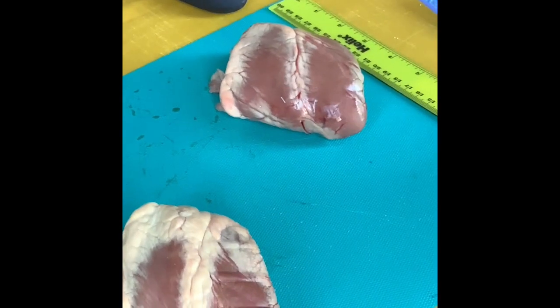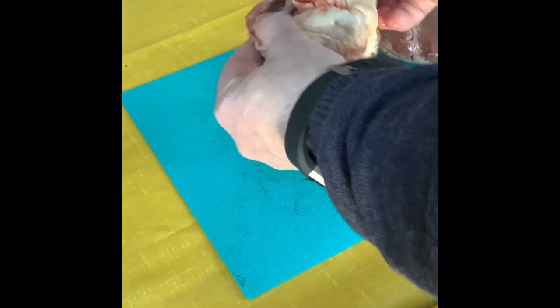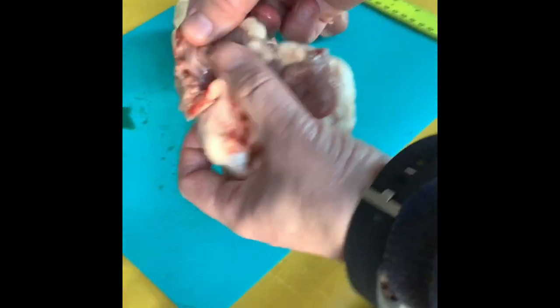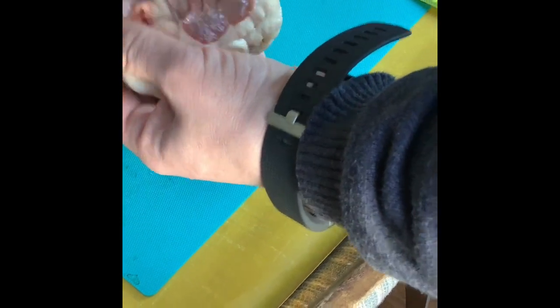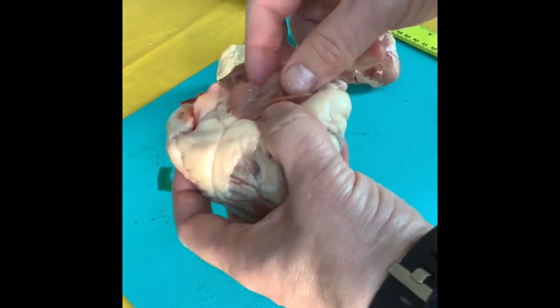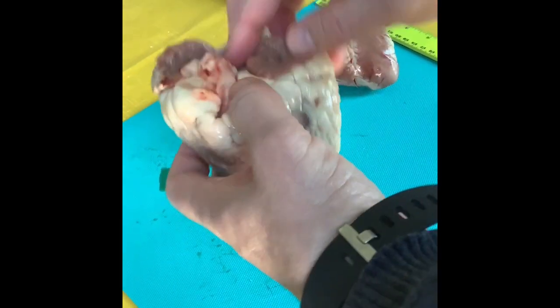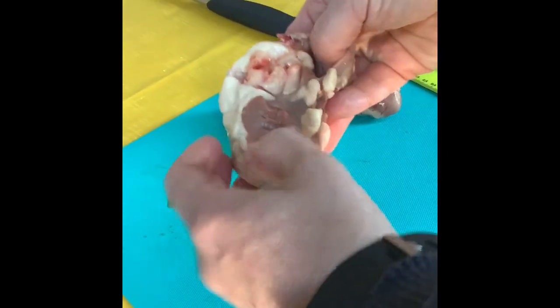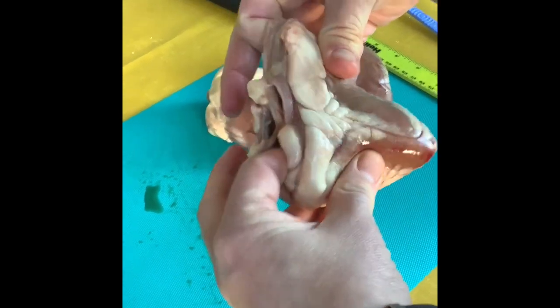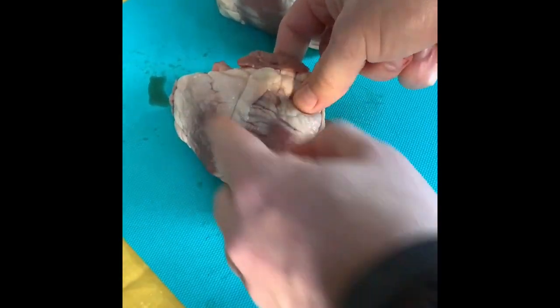First thing we have to do is decide which side is the left and which is the right. We can see the atria here — they're really thin, very flimsy. These hearts are sold for eating, so butchers normally cut the atria off. If we put our fingers down the sides we can feel that one side is really thin and the other is very thick — that thick side is the left-hand side. So this is the heart viewed from the front.